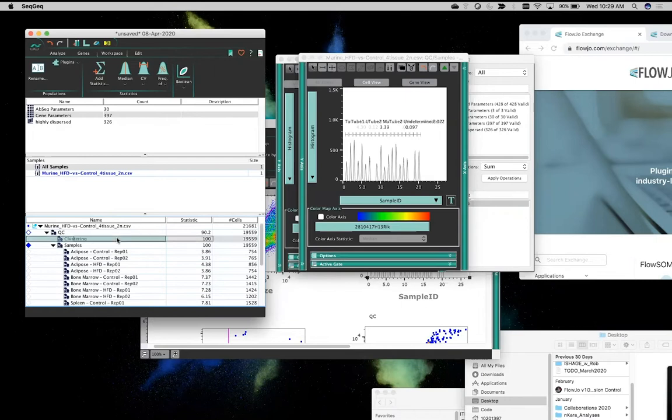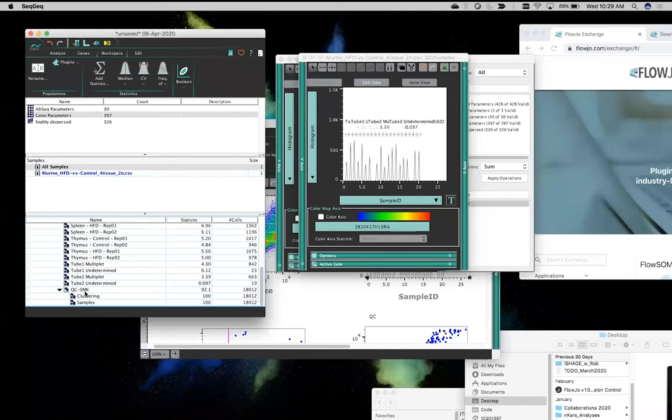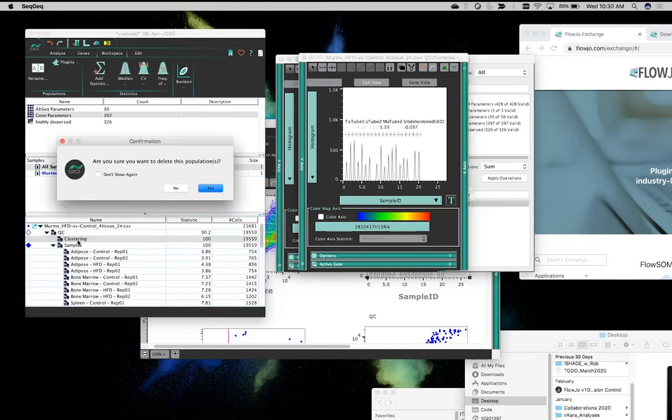I'm just gonna do that one more time. Very easy to do in this case. I can just drag our two layers into my final population of interest. And I'm actually gonna rename this something like QC SMK, because we use the sample multiplexing kit to arrive at this quality control layer. Finally, I'm going to add all of the different samples to my samples layer here, so we'll have them to work with. You'll notice that the SMK undetermined and multiplets are now all zero, so we've effectively removed those cells from the analysis going forward. And I can remove the clustering layer here.